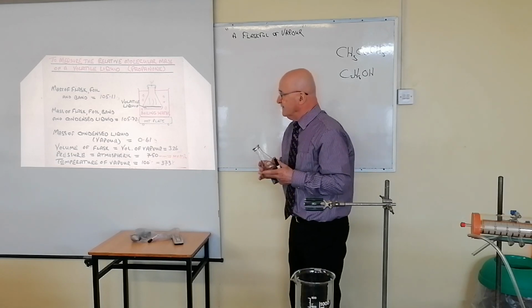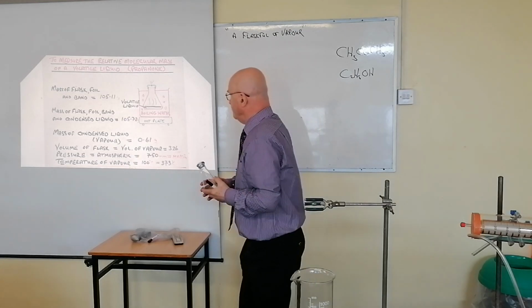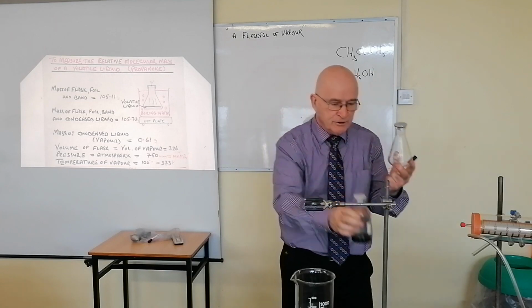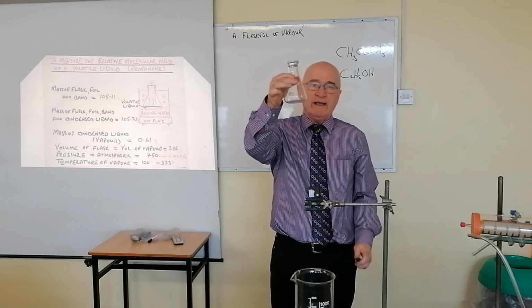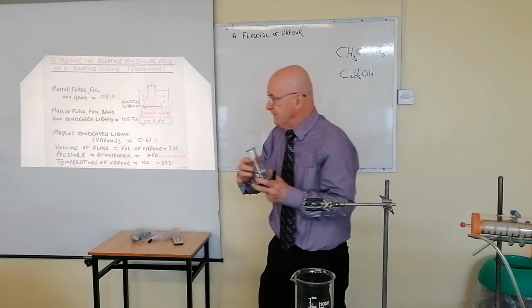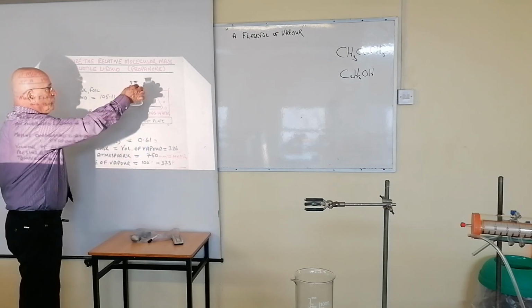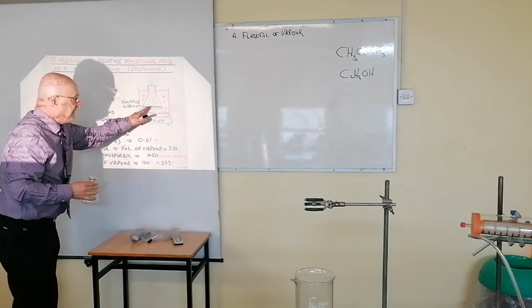Now what you must do next is you must basically arrange to fill this flask with vapor. And what you do is you take some of your liquid, this is the one I showed you already, propanone. You take some of this, take off the top, pour some liquid into this until you cover the base of it. You don't need much in there now. Cover the base of this with some of that liquid. The exact amount doesn't matter. And put the lid back on and place it in the apparatus as shown in the diagram. You have a hot plate, right? And you have a water bath. And basically, you will mount that there like that, and you'll proceed to heat it in the boiling water. And you have to watch that liquid very carefully.